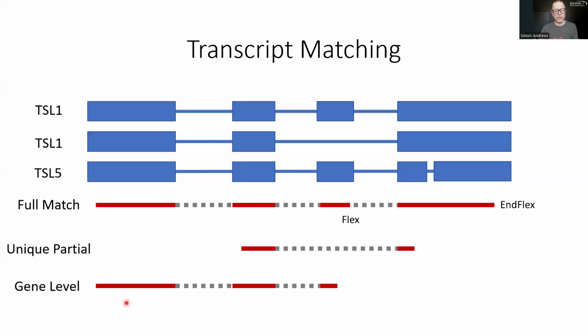So in this case, we can only quantitate this to gene level, but if we had applied a transcript support level filter and we'd said, well, let's only include transcript support levels 1 and 2, so the higher end of this isoform would have been excluded. And if we exclude that isoform, that would turn this final match into a unique match.